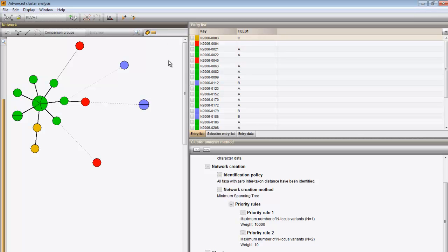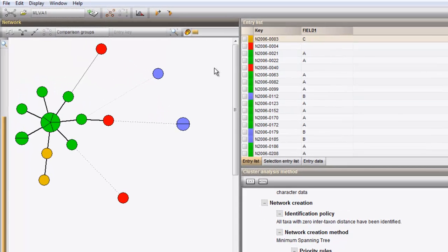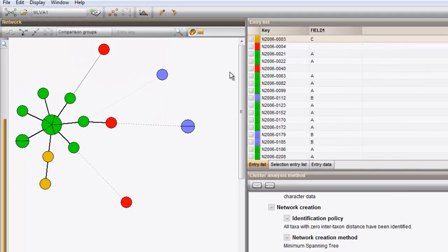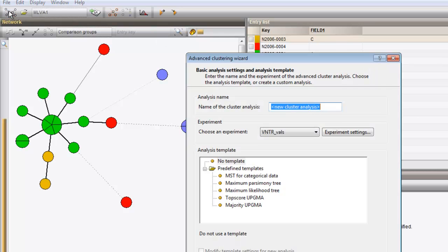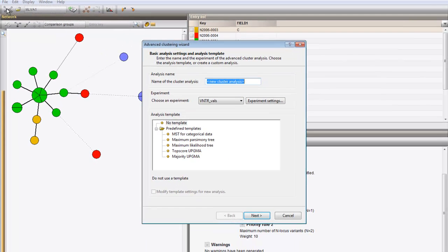In case you'd like to recalculate the tree with different priority rules, click the first button from the left to start a new analysis.